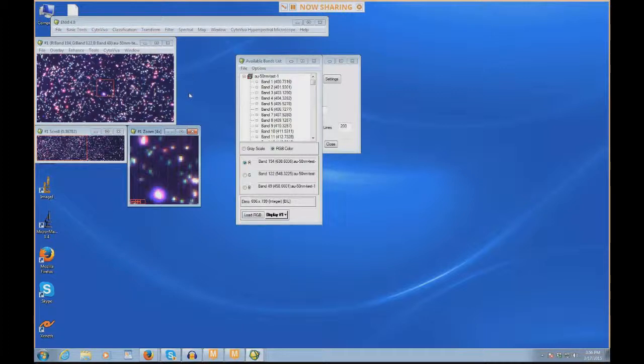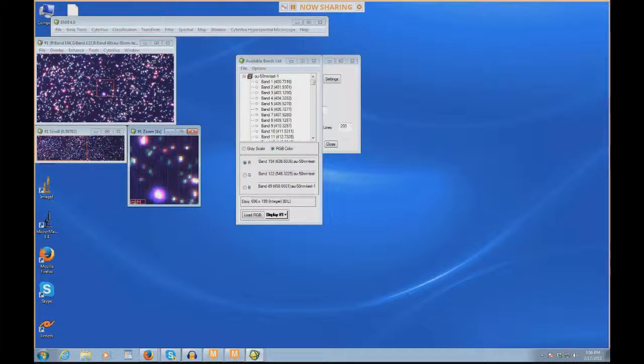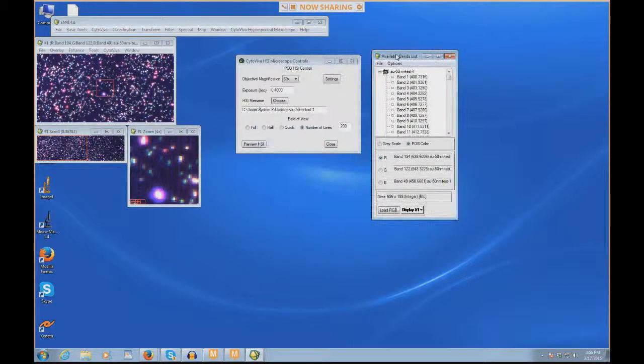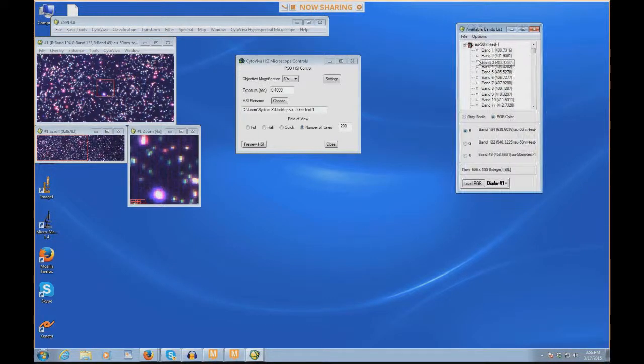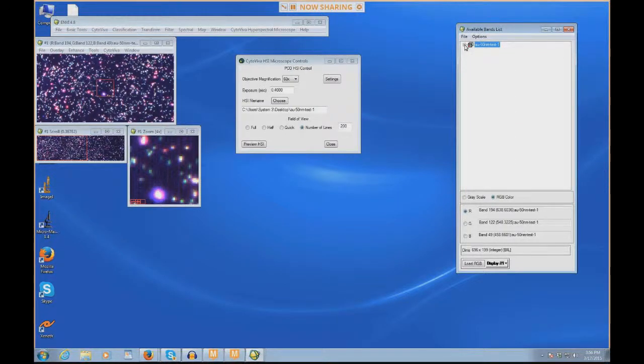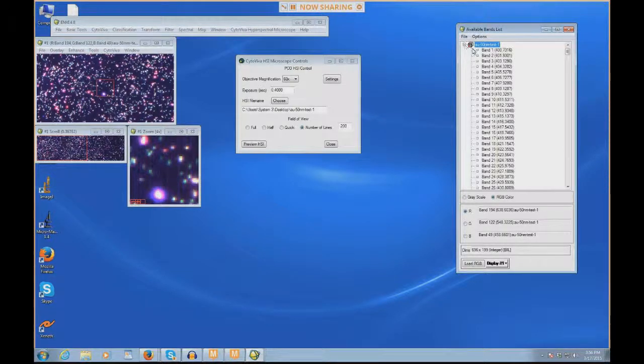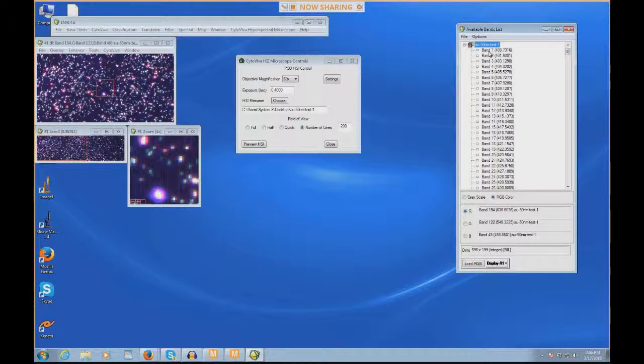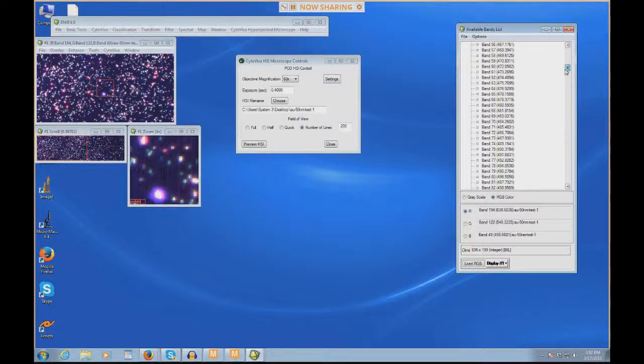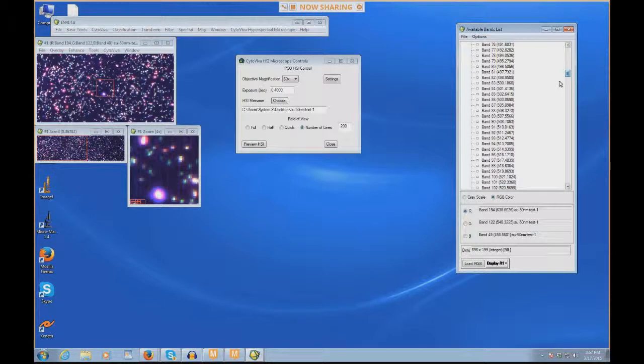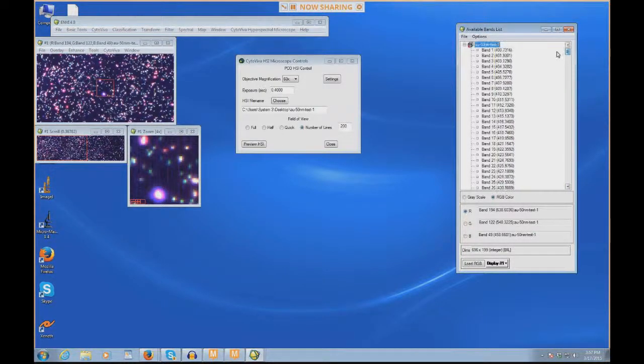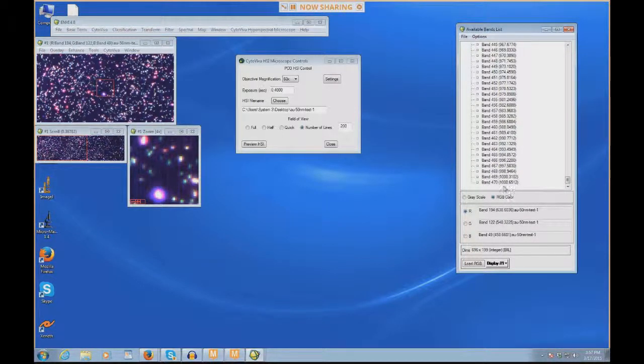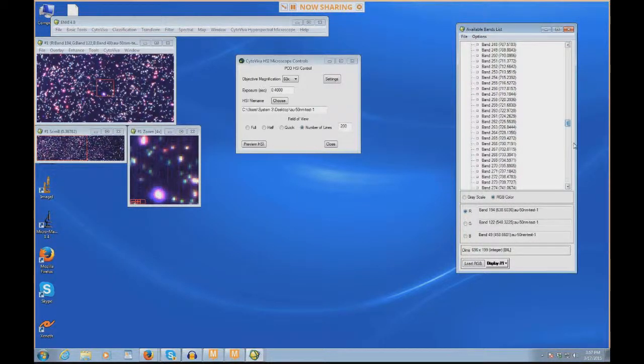What we see here in Envy are three windows. We see an image window, what's called a scroll window, and then a zoom window. We also see the available bands list show up. This available bands list basically just shows you any file that's open in Envy. If we expand it out, it shows you how many spectral bands are associated with this file and where they are. This file has 470 bands. Band 1 is at 400 nanometers all the way down to band 470 at 1,000 nanometers.